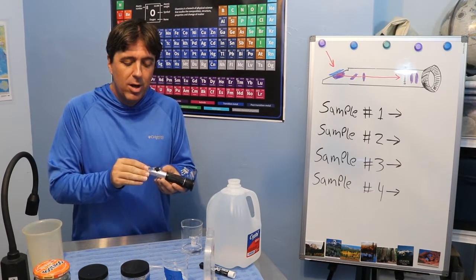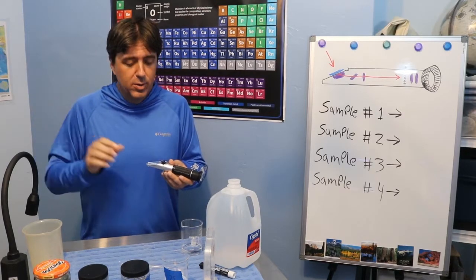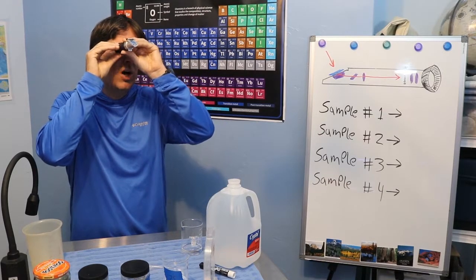If I compare this sample to the others, I want to make sure it's accurate, especially to that 1 part per thousand plus or minus accuracy. So let's look at this and we'll see where we are, and it's just off of 0.